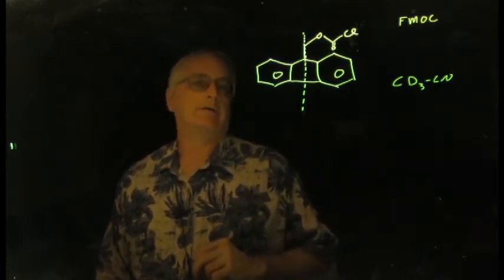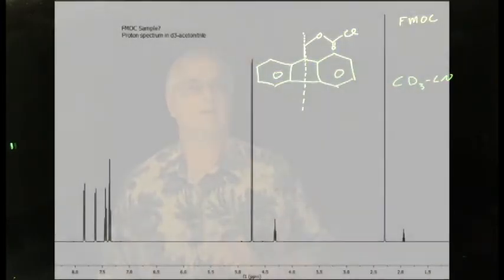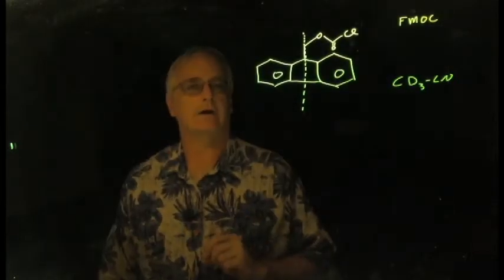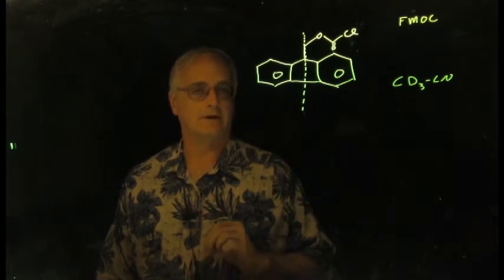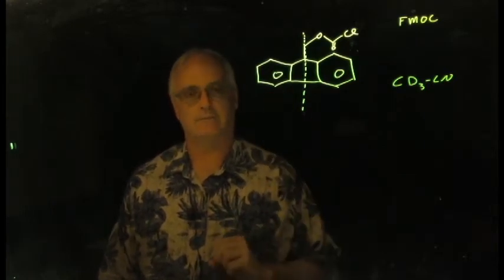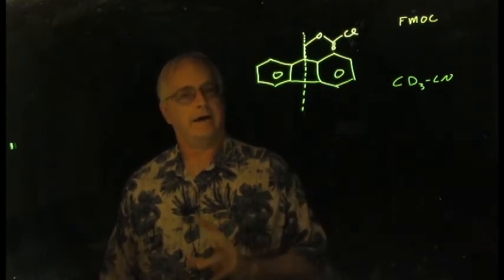We take a quick glance at the proton spectrum for a moment, and it is a very nice proton spectrum. We see lots of peaks in here. A lot of times students want to just dive in and start assigning peaks left and right, and that's good, but what we're going to do is think carefully about some of the peaks that we are going to see in this molecule because of things other than FMOC, than what we expect to see from FMOC itself, and see how that matches up.